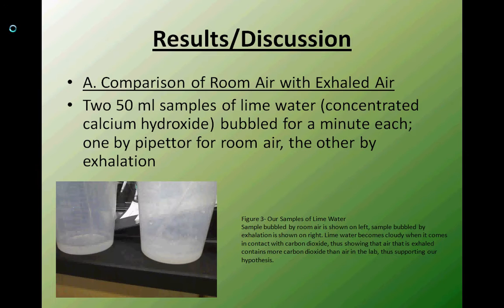Figure 3, which is shown on the left, is our samples of lime water. The sample bubbled by room air is shown on the left, and the sample bubbled by exhalation is shown on the right. Lime water becomes cloudy when it comes in contact with carbon dioxide, thus showing that air that is exhaled contains more carbon dioxide than air in the lab, thus supporting our hypothesis.